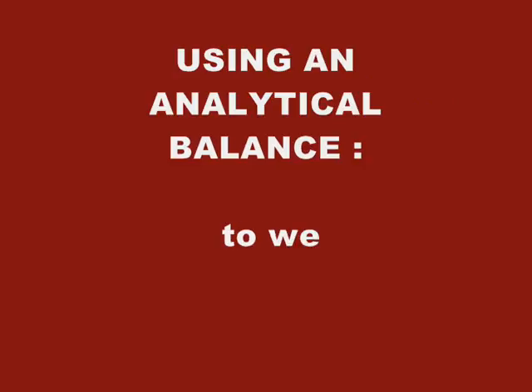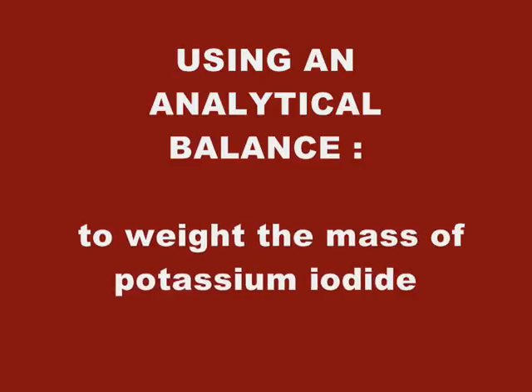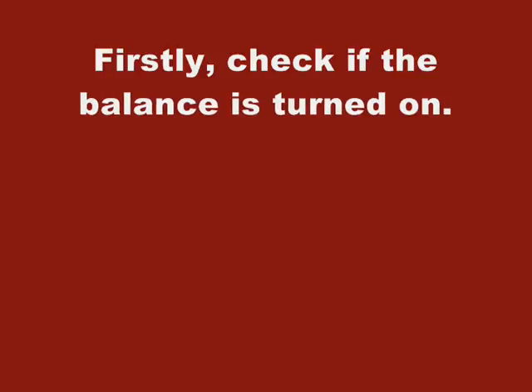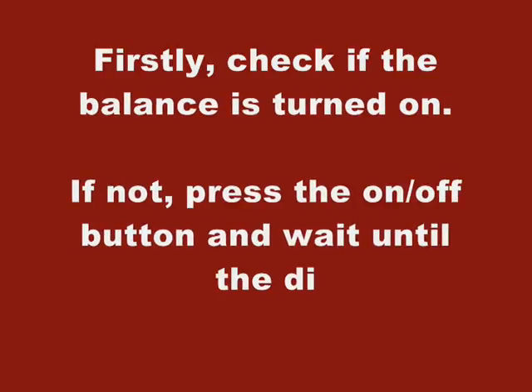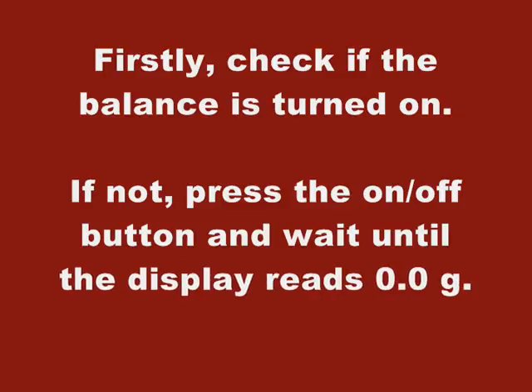Using an analytical balance to weigh the mass of potassium iodide solid. Firstly, check if the balance is turned on. If not, press the on or off button and wait until the display reaches 0.0 gram.